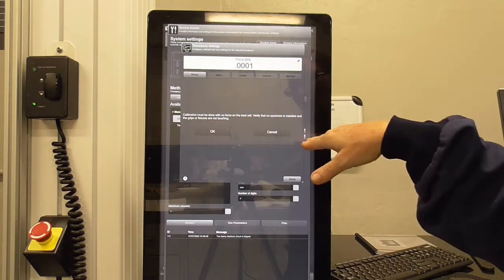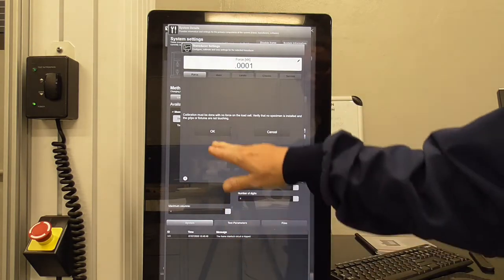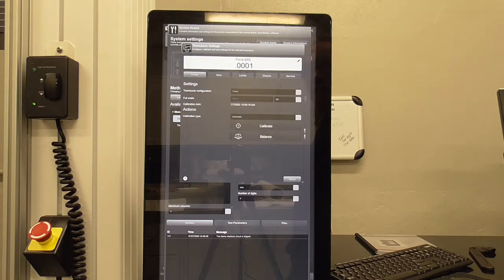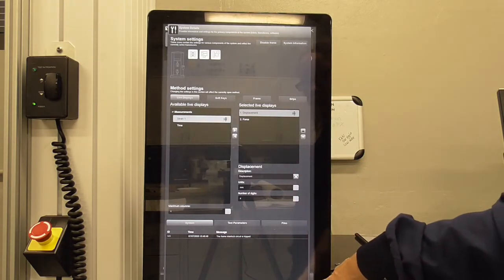When you hit calibrate, it gives you a warning that you can't have a dog bone gripped in the grips or any force on the load cell during calibration. If you do have a dog bone in the grips, loosen them so there's no force on the load cell, then hit OK. It will calibrate, zero the force, and then you can close the calibration page.